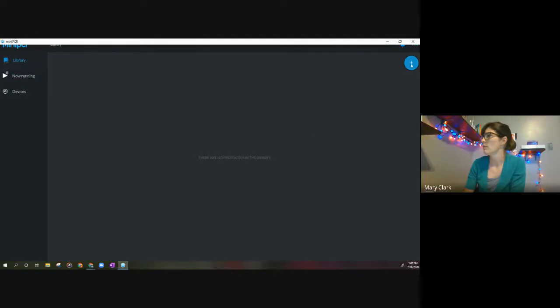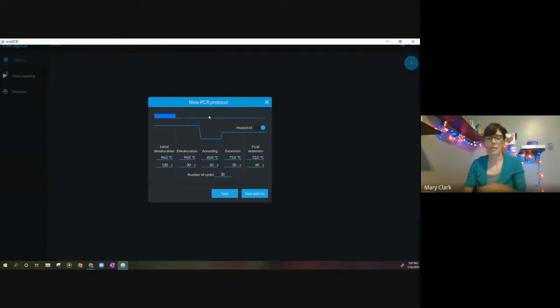There are no protocols in the library, that's fine. All right, so now we have it. I'm going to go PCR right here. I'm going to title this protocol CSI, for our crime scene investigation PCR.